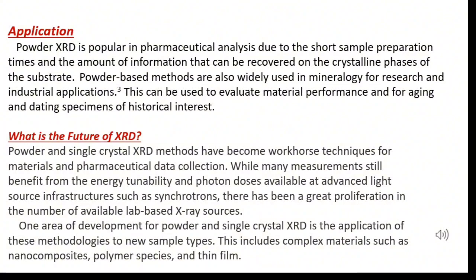One area of development for powder and single crystal XRD is the application of this methodology to new sample types. This includes complex materials such as nanocomposite polymer species and thin films.